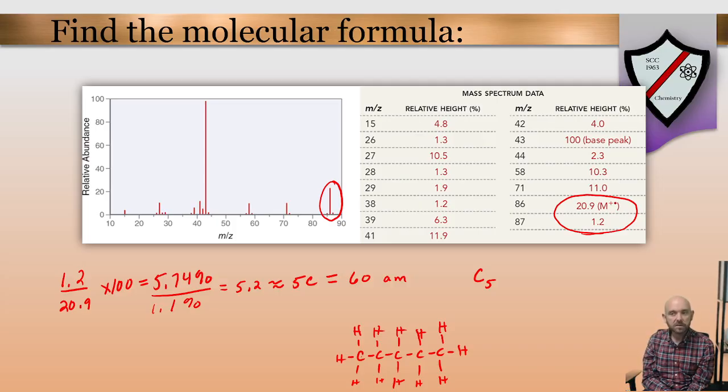And we know that it's not going to be a nitrogen atom, because this particular molecule has an even mass. And when we have an even mass, that generally means we have 0 nitrogen atoms, or we have 2 or 4. And we're just pretty much assuming we don't have a species with 2 or 4 nitrogens or anything like that. So there's no nitrogen atoms. So that means there must be an oxygen atom in there probably.